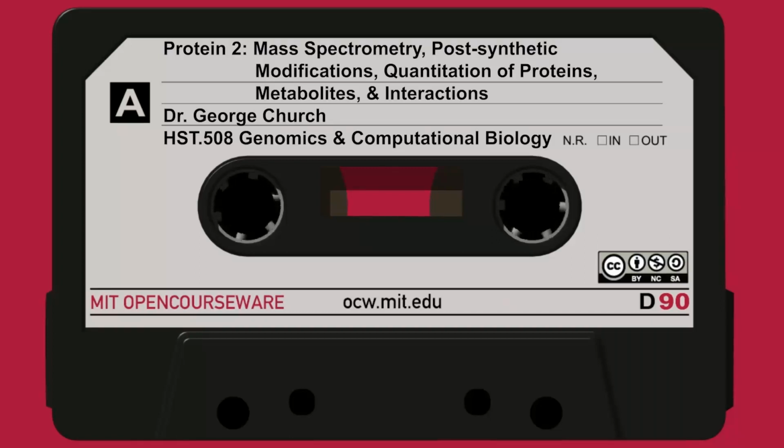In any case, you generate a virtual set of peptides. You generate a virtual set of mass peaks. Now, since we don't know the rules that determine the height of those mass peaks, we wish we did, but we don't, so we just set it to unity, some arbitrary value to make them all the same. So you're not going to be getting a great correlation coefficient based on the heights, but merely whether it's there or not. And that's what you do: every time you have a hit between your predicted spectrum and the other one, no matter what the intensity of the other one is. So you weight it on the observed intensity, but you have no real calculated intensity.